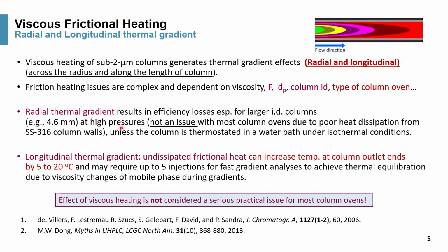But after much research, it's really not an issue with most column ovens because most of them have pretty poor heat dissipation from the stainless steel column wall. So unless the column is thermostatted in a water bath under isothermal condition, it's not a practical problem.